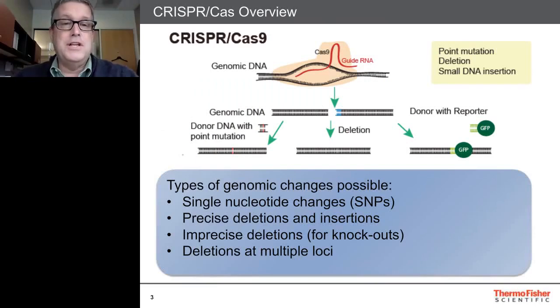These technologies, which include CRISPR, TALEN, and zinc fingers, can help study gene functions, make gene mutations, tag genes, and for other purposes, stably integrating new sequences. Really, almost anything that is biologic can be modified using these genome editing applications.